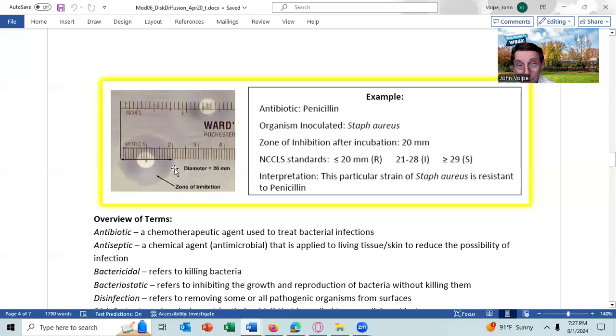20 millimeters. And so we would prefer not to use this antibiotic because we classify this species as being resistant to that antibiotic. And so if you were to treat this patient with penicillin G, any bacteria that would be 20 millimeters or more away from the blood vessels, those bacteria would not die. Okay?